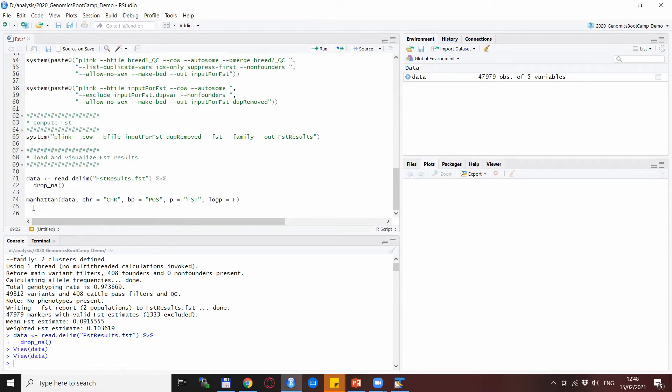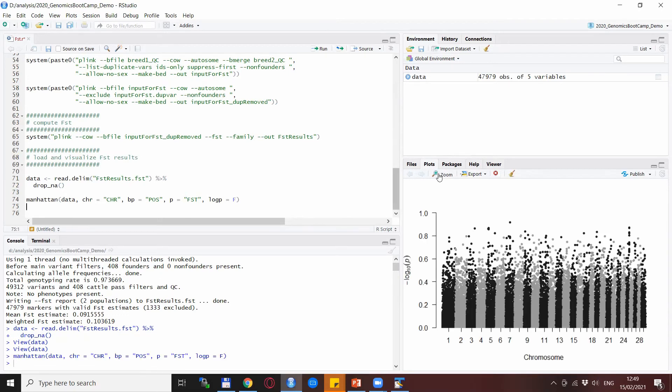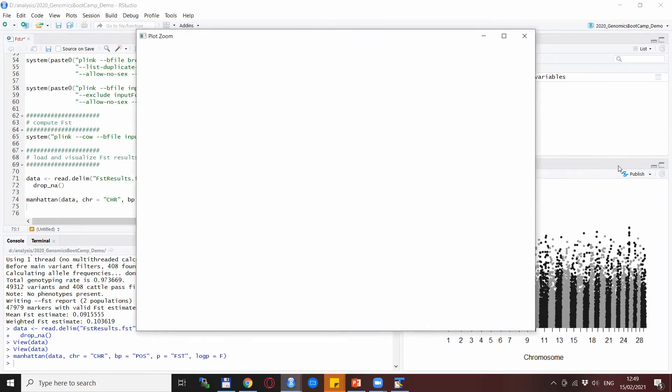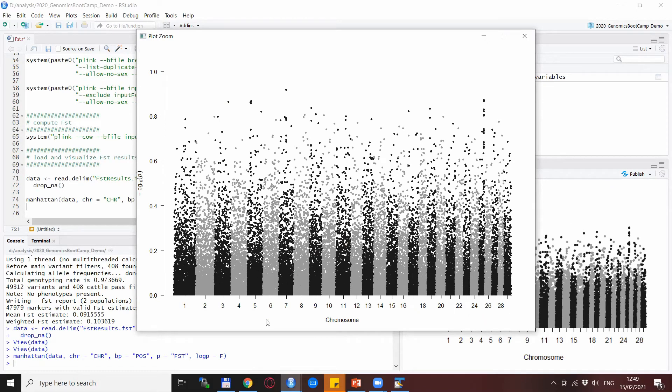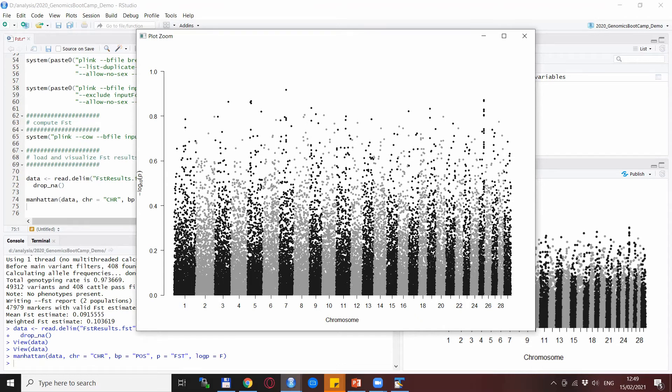Then we go for the visualization with this very nice function called Manhattan. Here is the output where we see that most of these SNPs are pretty similar between the two breeds, but indeed there are some signals with very high FST markers that potentially show the differences in the genetic makeup between the two populations and could be used, for example, also as selection signatures.